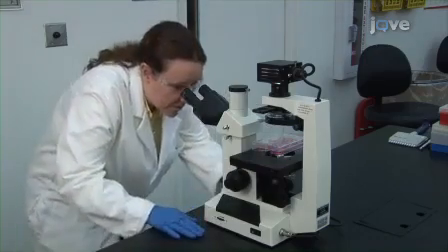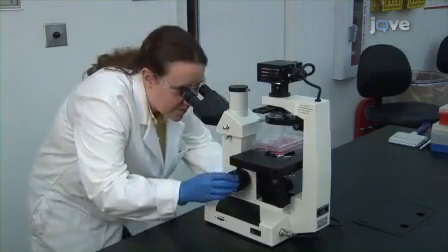The Mission Target ID library is designed to assist in the discovery and identification of gene targets for microRNA. Here, we demonstrate its use and application.